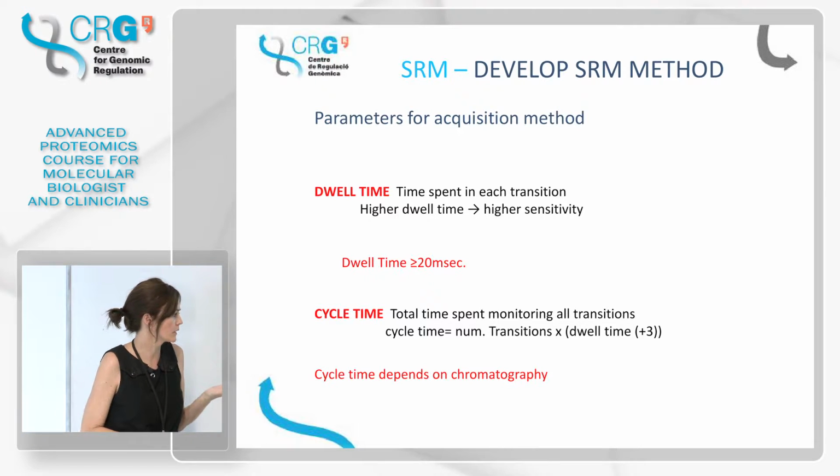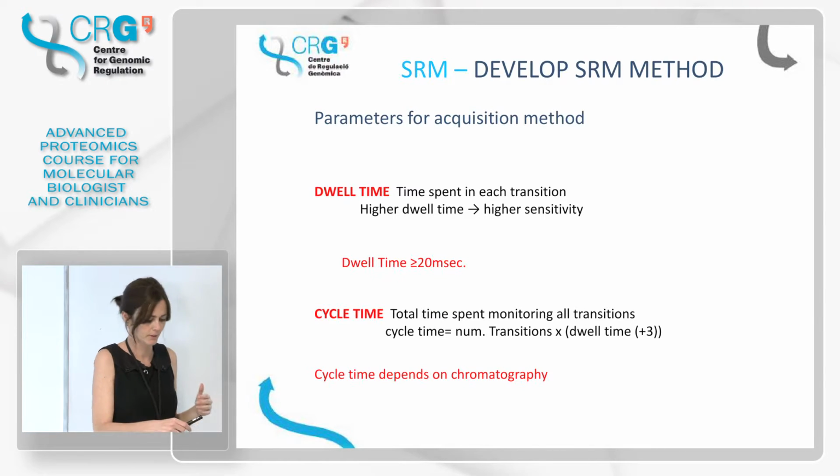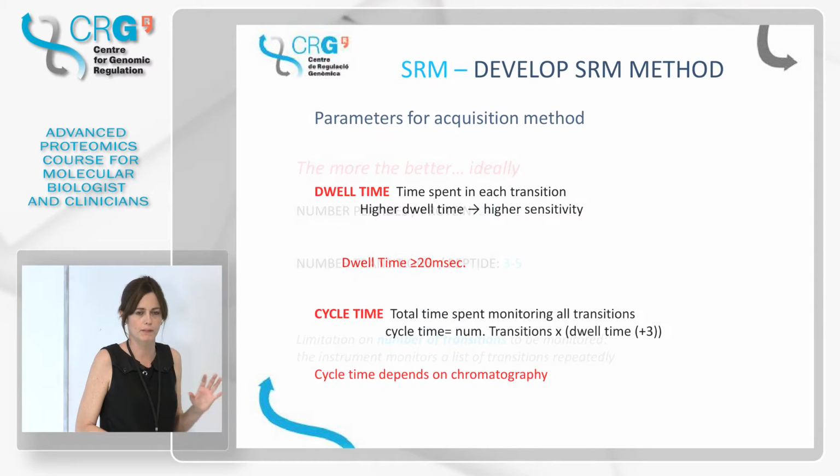Okay, and the cycle time, you know what it is? No? It's the time that we spend measuring all these transitions. Very importantly, cycle time depends on your chromatography, and this you do need to play with, unless you never touch your chromatography and it's very reproducible and you know exactly which is your best cycle time.